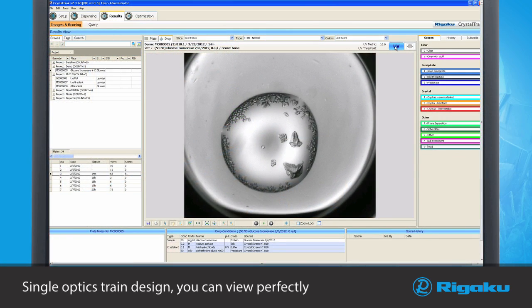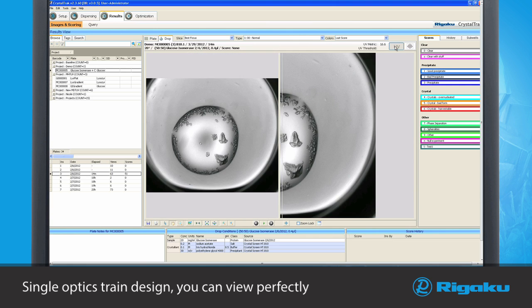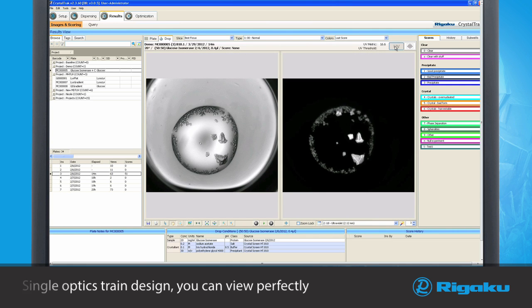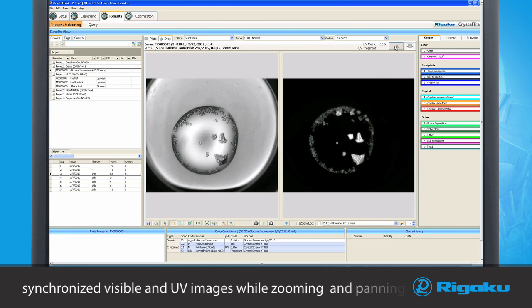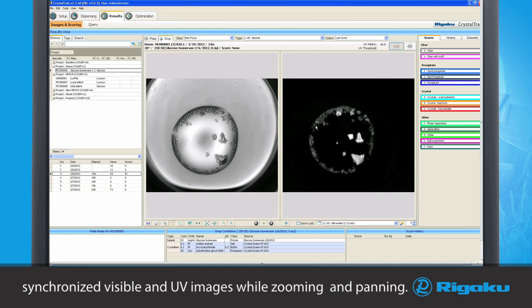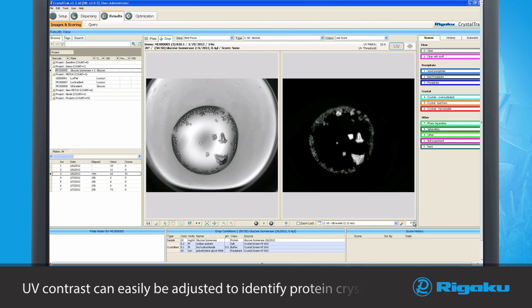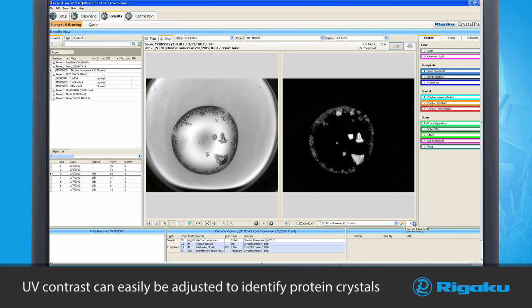Because of its single optics train design, you can view perfectly synchronized visible and UV images while zooming and panning. In addition, the UV contrast can easily be adjusted to better identify protein crystals.